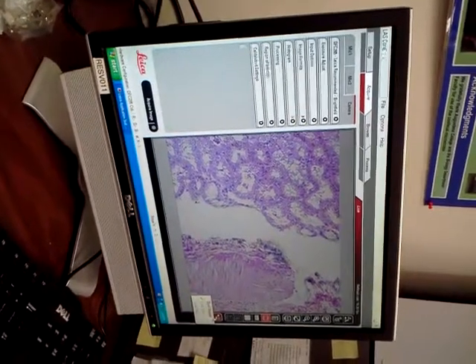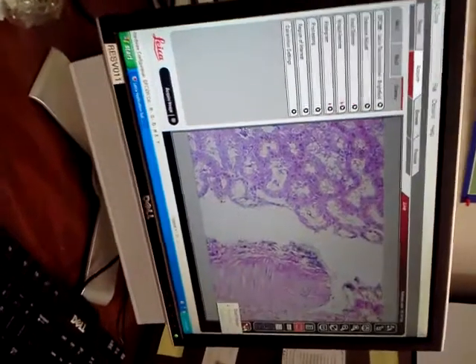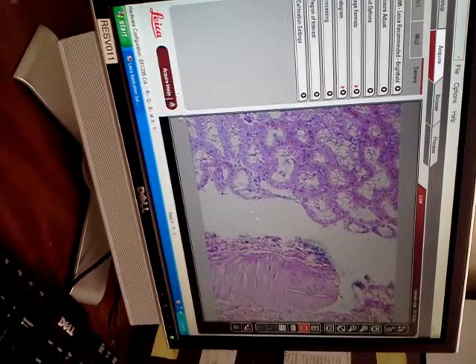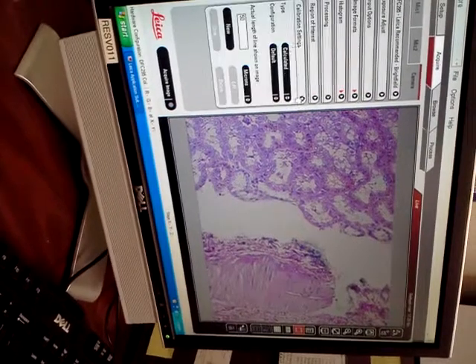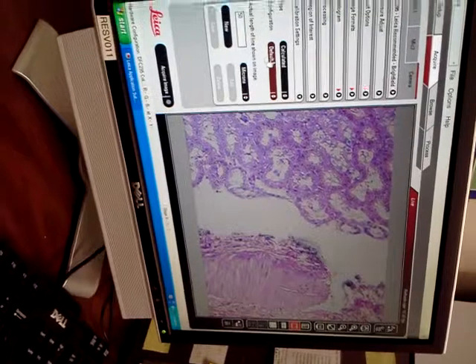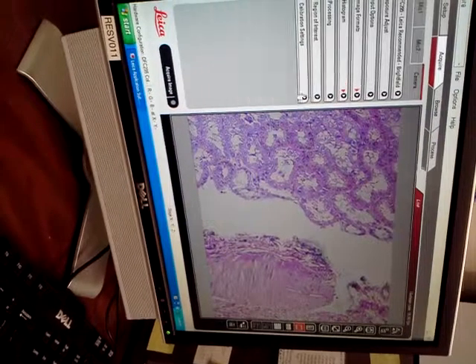Again, I don't want to go too in depth on all these extra features, but it's okay. We'll capture this image first. I've gone through all this, and the calibration is calculated based on all the information that we've told it. It's going to be in microns. We're good to go. So I'm going to capture this image.